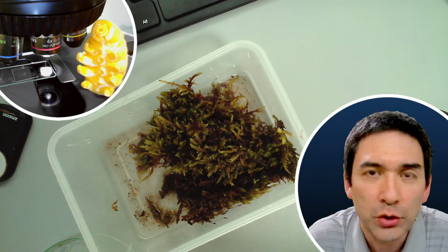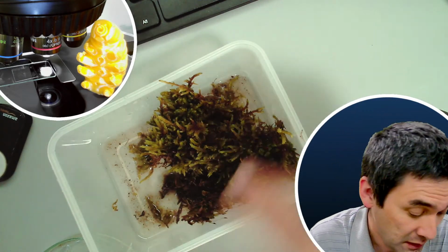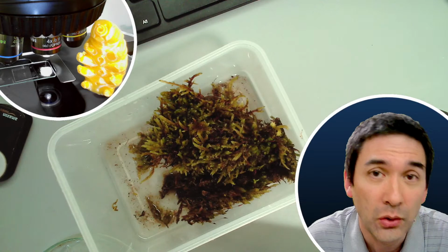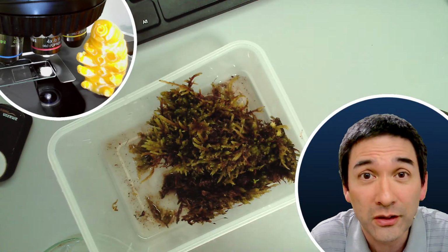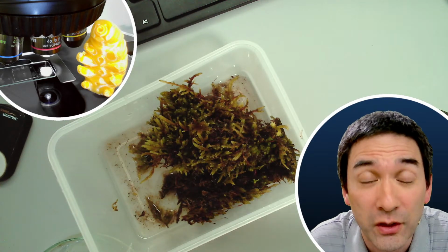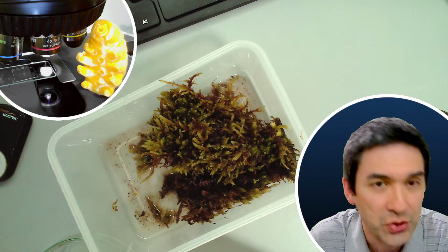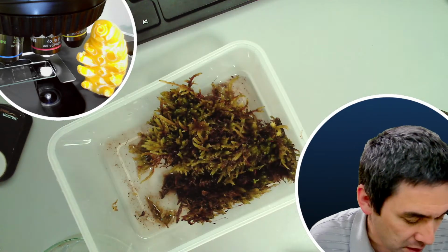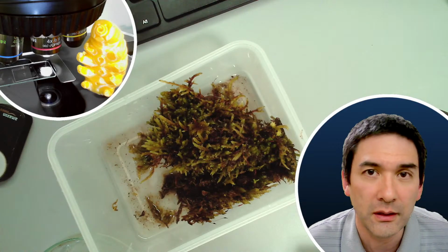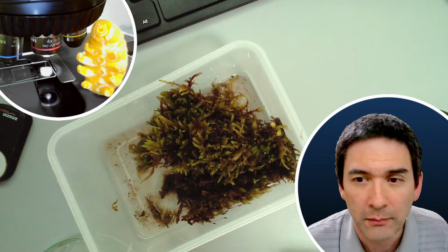Basically what you have to make sure is that the moss, in many cases, is quite dry, but you have to make it moist because the tardigrades are able to survive dryness. They're not able to survive heat very well. They don't like heat, but they can survive dryness. And when you make the moss wet and leave it wet for, I don't know, a day or two, then they basically come back alive, and then you're able to extract them from the moss, which I'm going to show you how I do that.